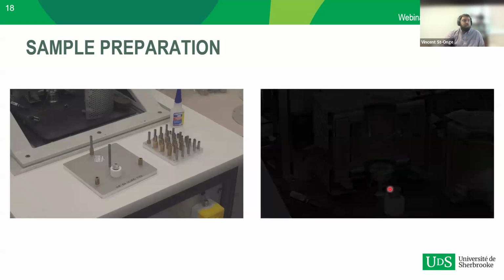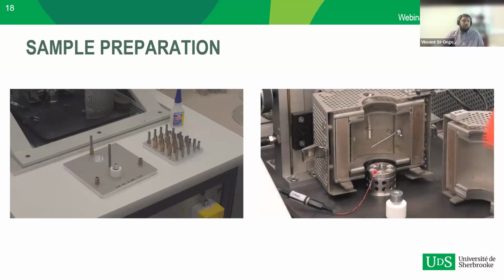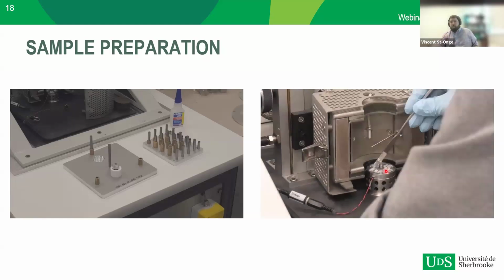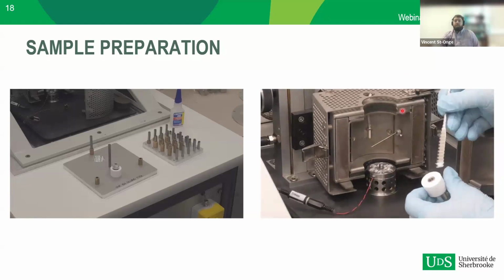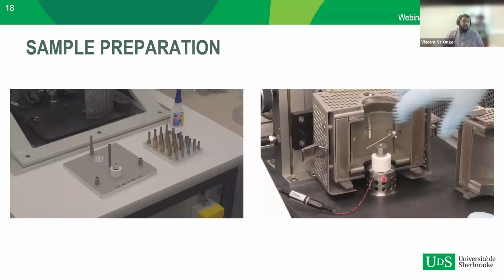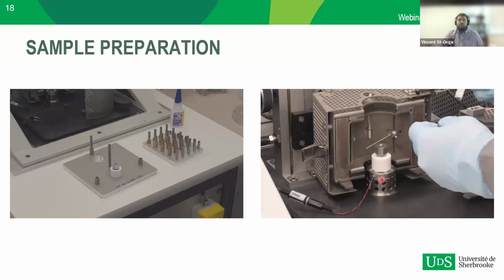Once you have that, it's very, very important to apply a little bit of grease on all the components to avoid any cavities that would then induce additional vibrations on your measurement. And then when everything is greased all together, we will just have to screw things in place and put the accelerometer on the top. As you saw, the base is shaking, so literally it's a shaker.